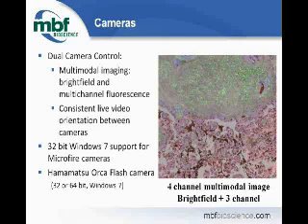Thanks for the question. A lot of customers in the past have bought microfire cameras. As most of you have found out, the camera manufacturer didn't provide controlling software to support Windows 7. However, with version 10, we're now able to support microfire cameras in 32-bit mode so that your investment in that particular camera can continue. If you want other 64-bit or other Windows 7 options, please contact us, and we have several other camera options available.